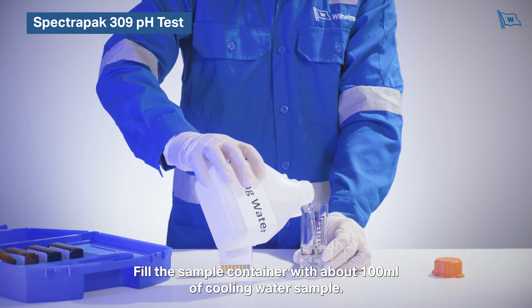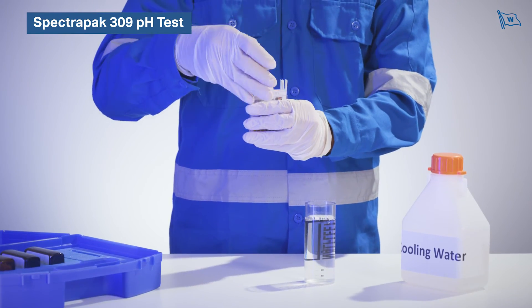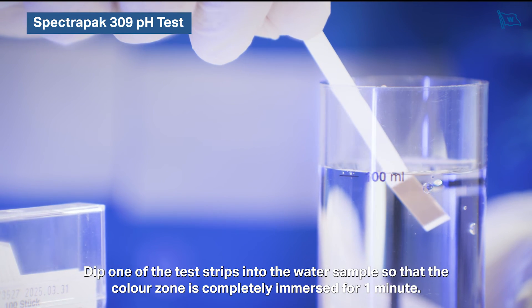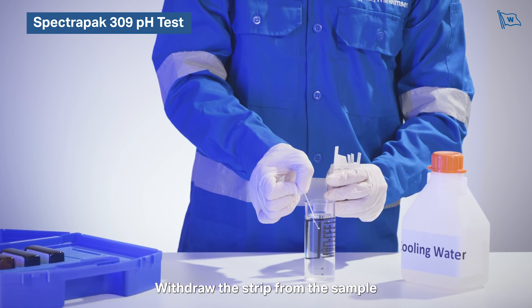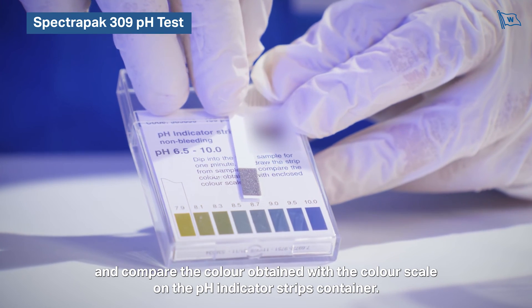Fill the sample container with about 100 millilitres of cooling water sample. Dip one of the test strips into the water sample so that the colour zone is completely immersed for one minute. Withdraw the strip from the sample and compare the colour obtained with the colour scale on the pH indicator strips container.